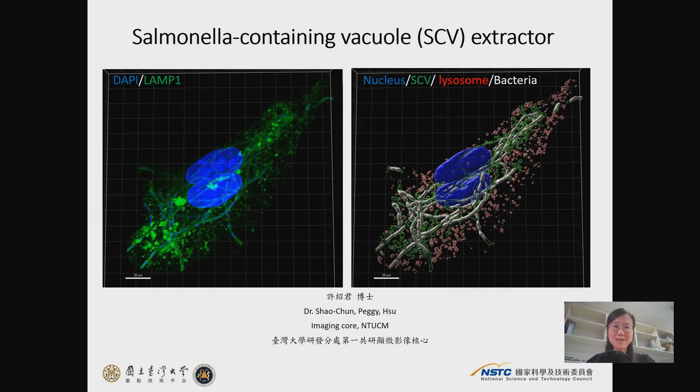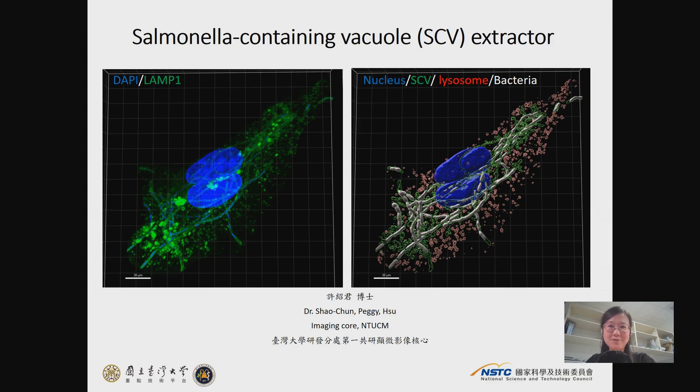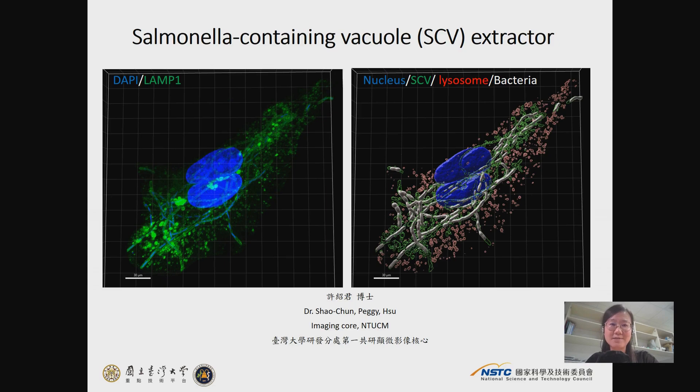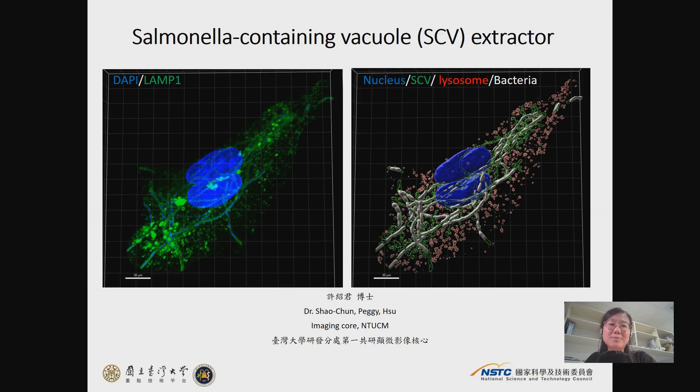Hi everyone, I'm Peggy, working at Imaging Corps of National Taiwan University. This is the tutorial for the tool Salmonella Containing Vacuole Extractor, aiming to extract the bacterial DNA and SCV structures from DAPI and LAMP1 staining results. As shown here, the image will be compartmented into four parts from the dual staining image after the analysis of this tool.